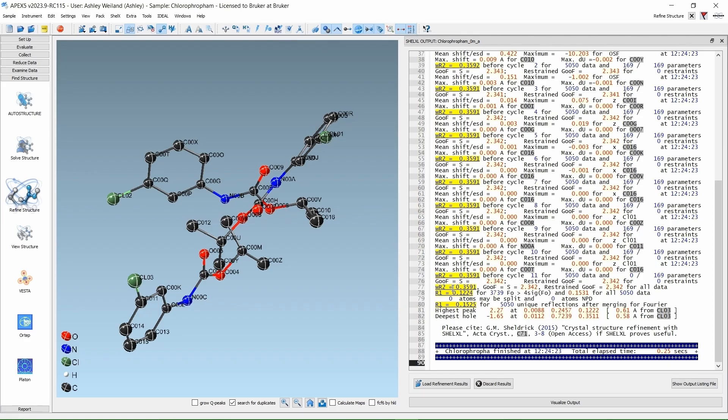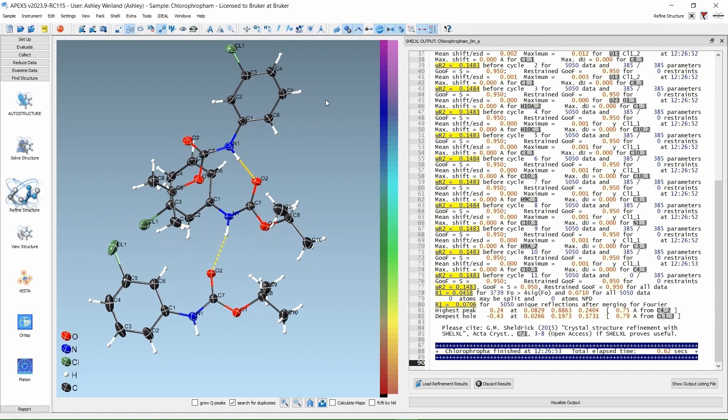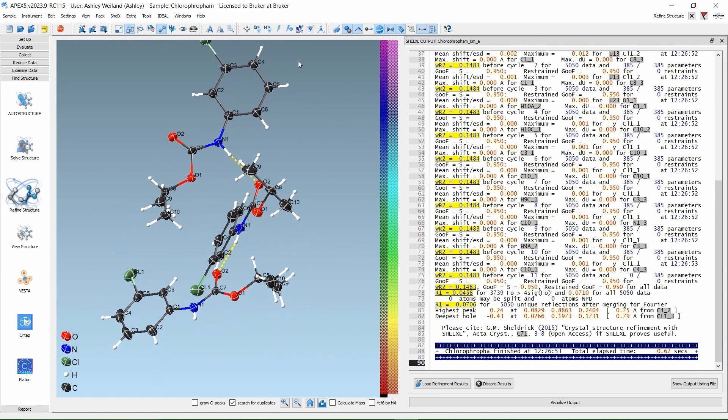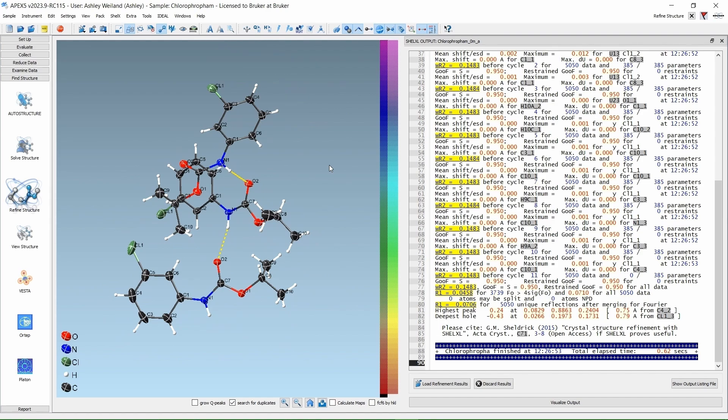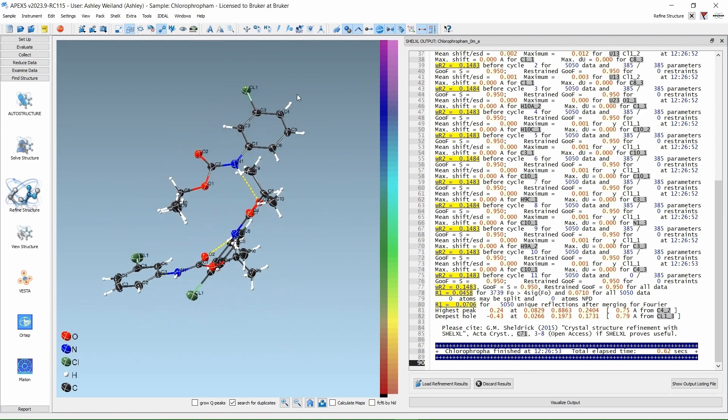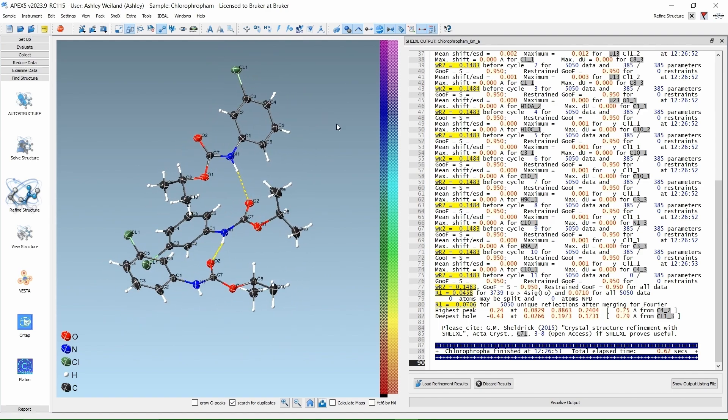After some refinement that we will go over in another video, we end up with something gorgeous like this with an R1 of 4.6% and a WR2 of 15%. Not bad for just three minutes of data collection.